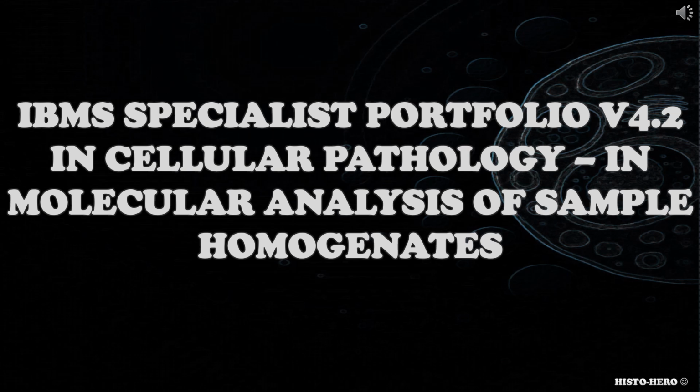And today's video will be about molecular analysis of sample homogenates, which is part of the IBMS specialist portfolio in cellular pathology.